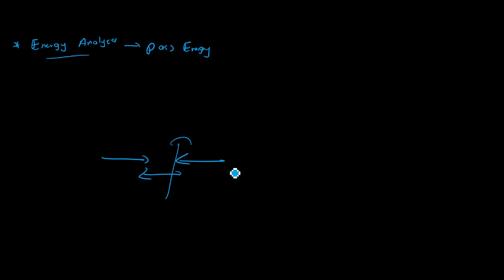But there's a problem, and there are also advantages. One thing is you will have very high resolution. Your peaks are accurate, your data are accurate, right? There's the accuracy and higher resolution.